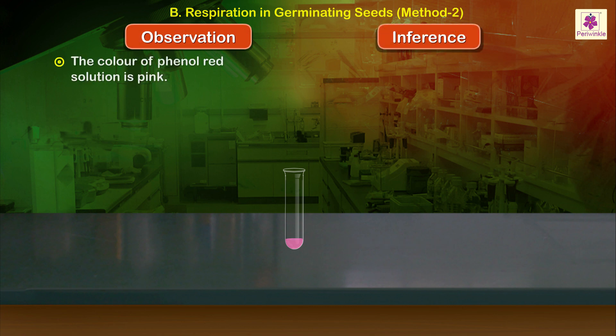Initially the color of phenol red solution is pink. Initially the phenol red solution is neutral.